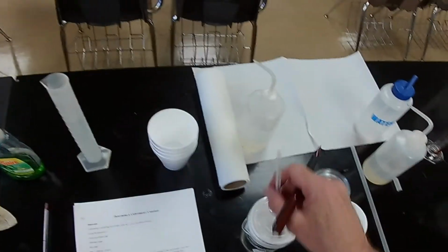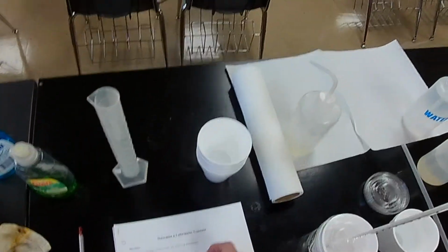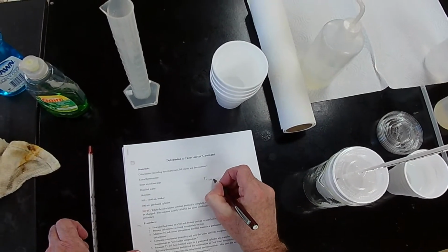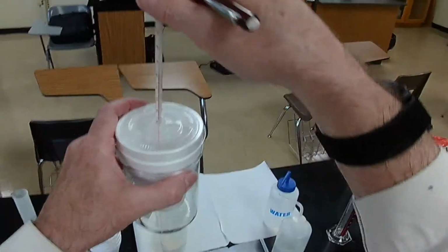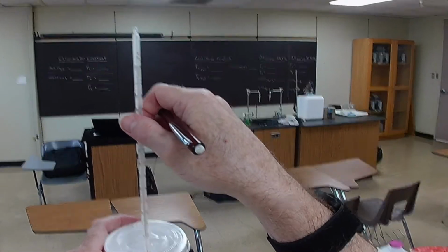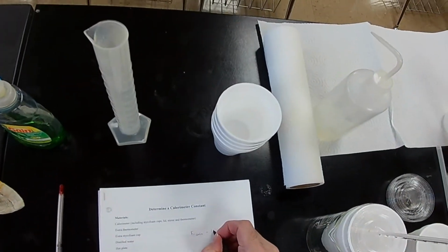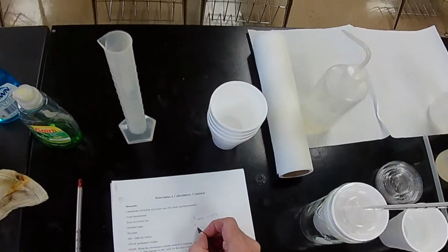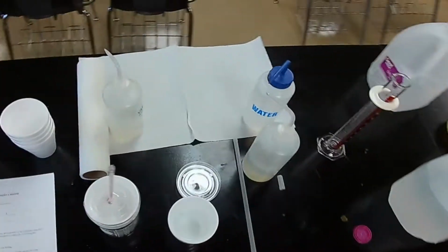So, what's the cold water temperature? Temperature, cold, equals what? Get it up to eye level, and it looks like 21 degrees. 21 degrees for the cold. Centigrade. And temperature initial for the hot equals what?